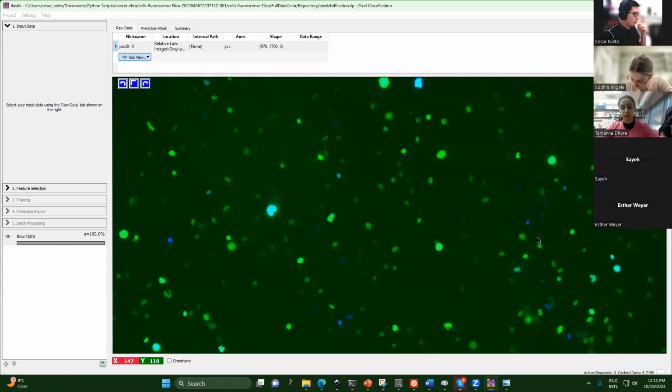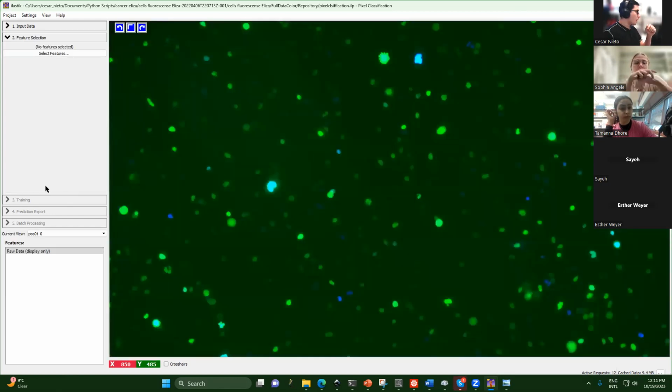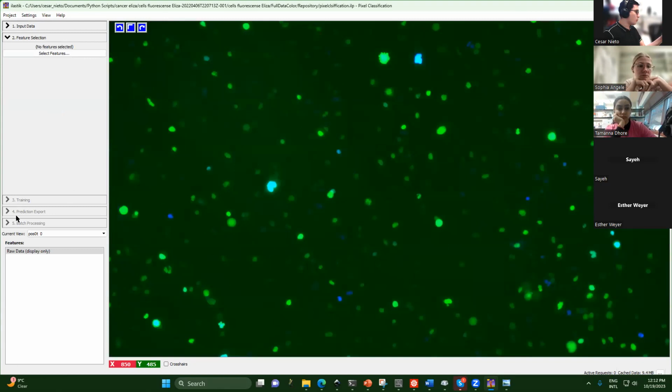But I think the actual video has around 300, but I didn't do it because segmenting such an amount of frames is too much. Okay, so here we select the next step. Once we upload the first data set, we can do the second step, and then we can do the 3rd, 4th and 5th steps.